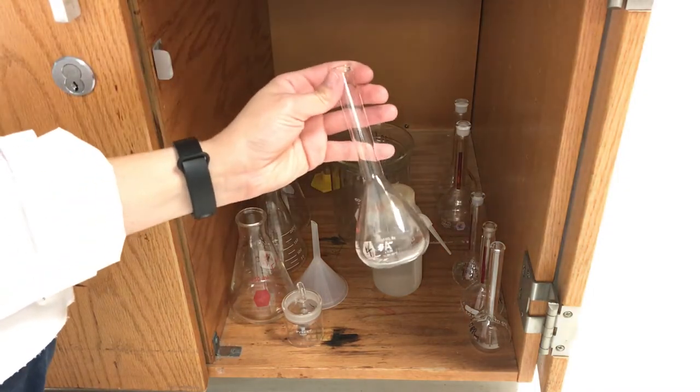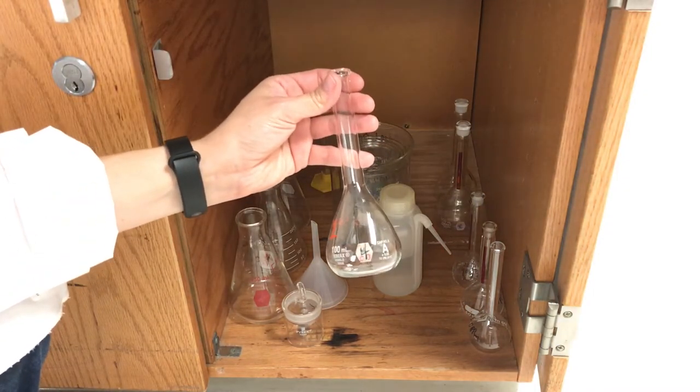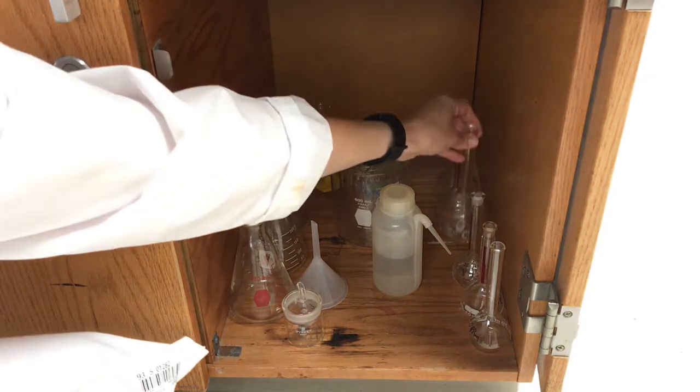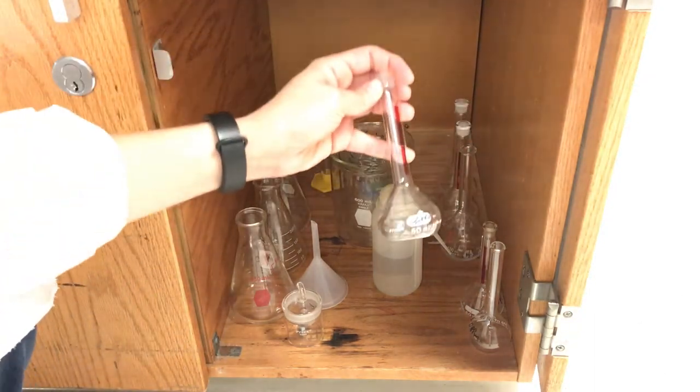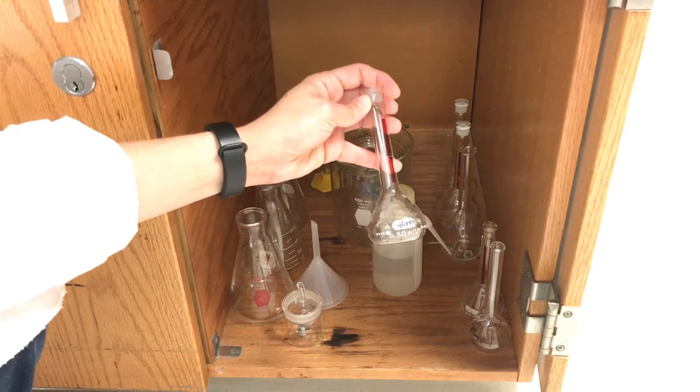Also in the cupboard you're going to have three 100 milliliter volumetric flasks. You're going to have three 50 milliliter volumetric flasks.